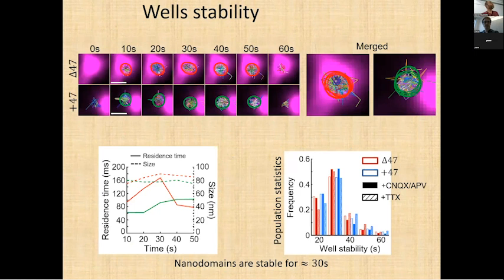And the last thing I wanted to say is that you can do a time-lapse analysis, which says take your data between 0 and 10 seconds, 10 seconds, 20 seconds, and so on, and then apply your algorithm to look at how the structure can be reconstructed from independent trajectories. That's very interesting because it means that you don't have correlation, at least not in time. So then you get all of these potential wells reconstructed, and there are moments of time where there is no potential well, and it disappears, and it can reappear again.